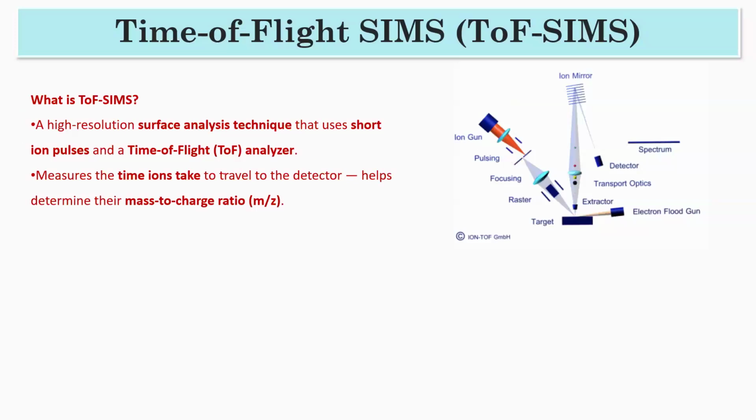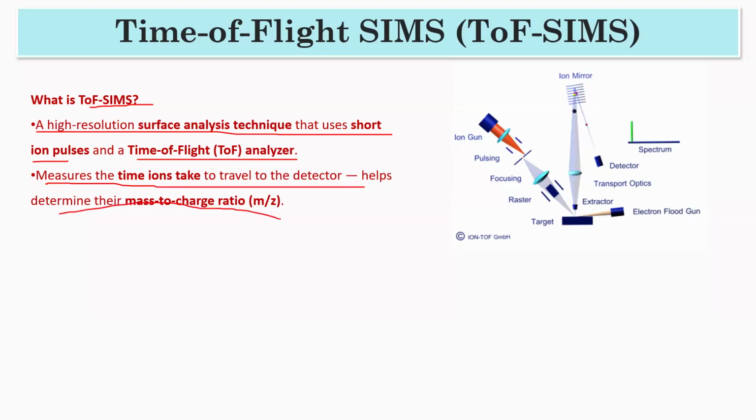Okay, so here I have written something. What is TOF-SIMS? A high resolution surface analysis technique that uses short ion pulses and a time of flight analyzer. It measures the time an ion takes to travel to the detector, which helps determine its mass to charge ratio.